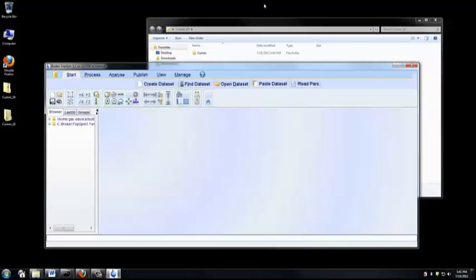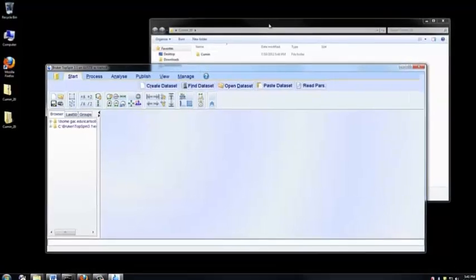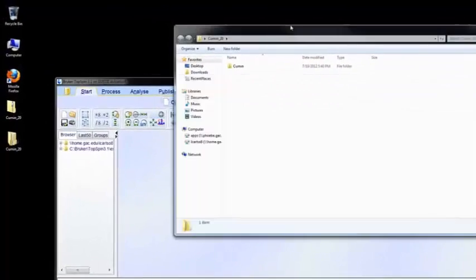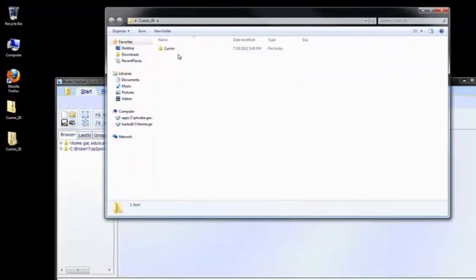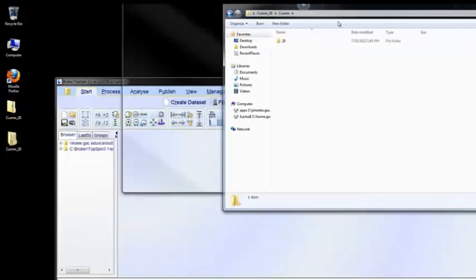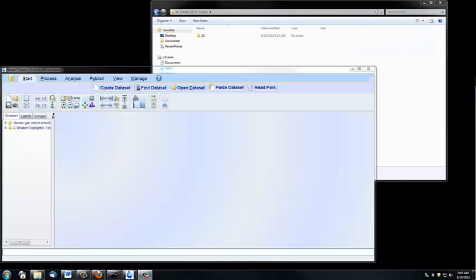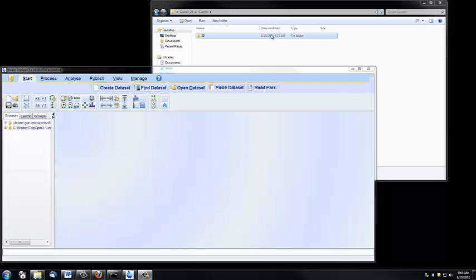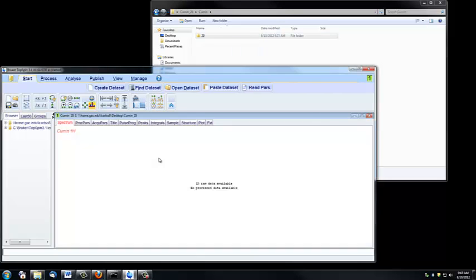The next thing I need to do is import the data into TopSpin. If I double-click on this title, which is Cumin, I'll get to the actual experiment number. I can just drag this file straight into TopSpin. You'll notice it says no processed data available, and that's because we haven't processed the spectrum yet.